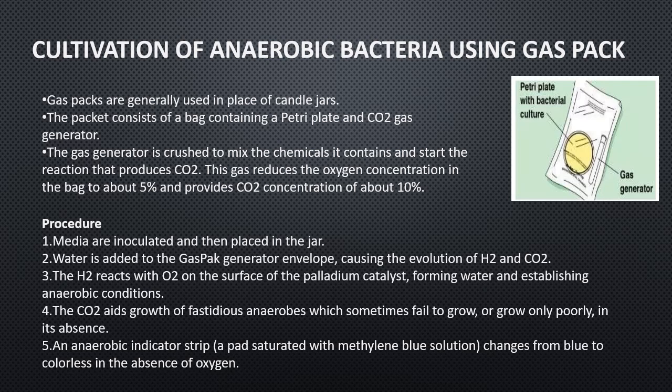An anaerobic indicator strip is also present, okay, which has methylene blue solution on it, and it works as an indicator which shows that the environment is now deprived of oxygen. Okay, so the color changes from blue to colorless when the concentration of oxygen gets reduced.